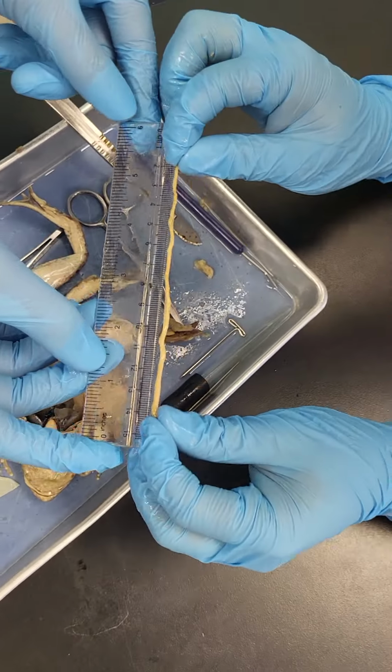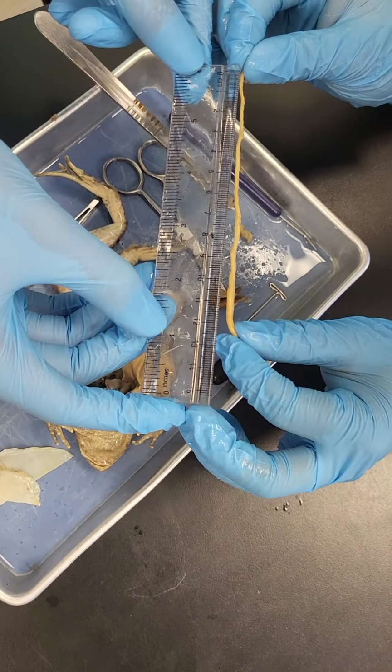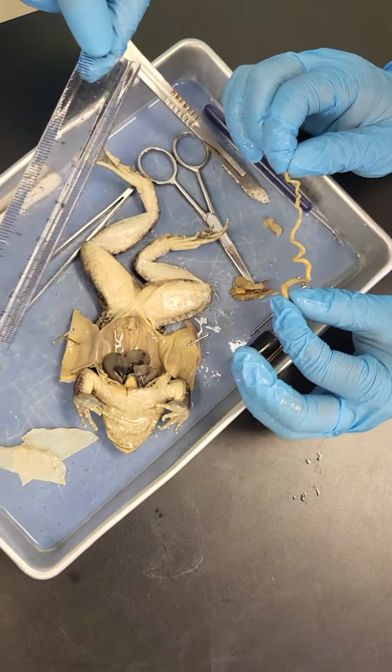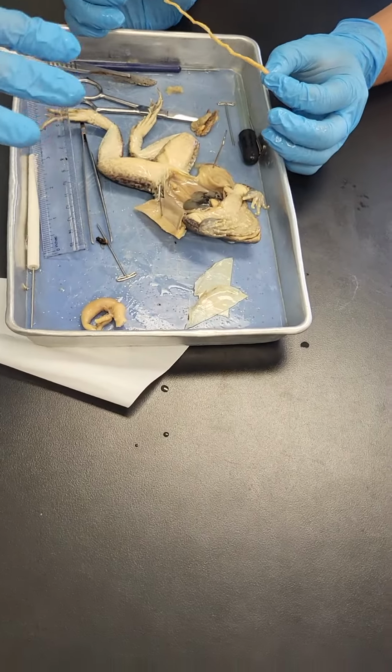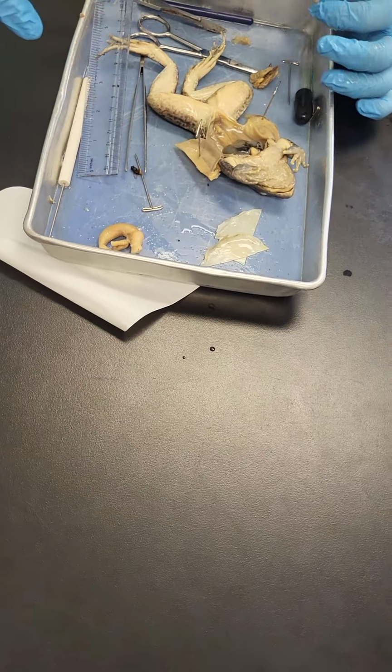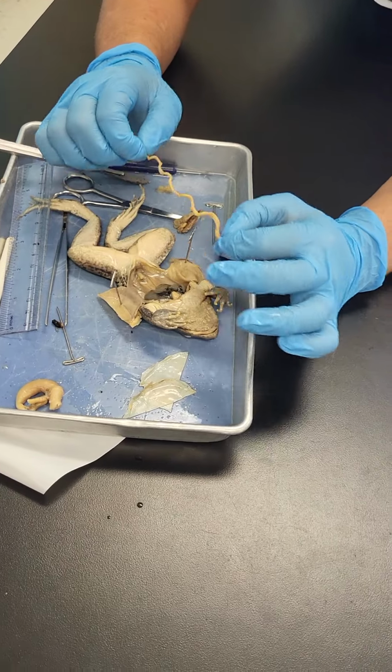So we have to measure in centimeters, so this is about 11? What happens if I drop this? Oh, no, right, 13. 13 centimeters. Well, no, I'm holding something. Yeah, it's 14 centimeters. You have frog juice. And now measure the whole frog. Yeah, record. No, you recorded because I have frog juice on my right hand. Head to toe.